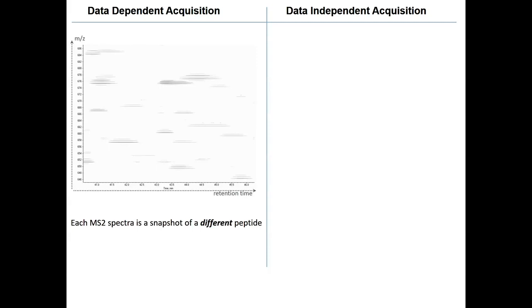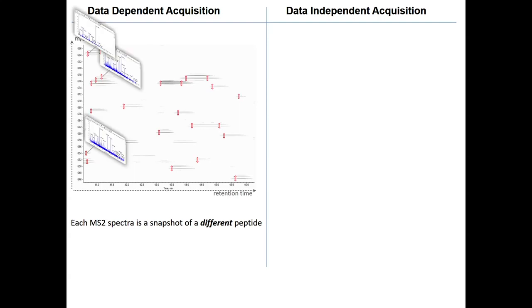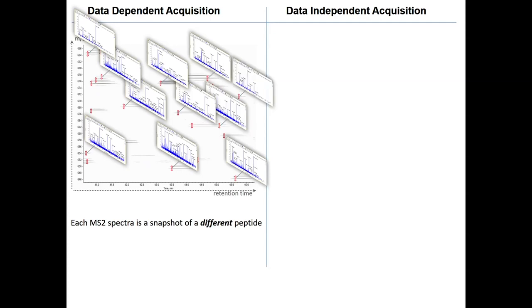This is just to remind you shortly of what, to me at least, is the most important difference, and the reason why I originally thought trapping instruments were maybe not the best instruments to work on DIA. This is MS1 space, retention time versus m/z, a very short zoomed-in version of this MS1 space. You see in red the isolation window that's used in DDA mode. And typically from each of these isolation windows, you get a relatively nice and independent MS/MS spectrum. And in shotgun DDA, you expect that each of these MS/MS spectra is a snapshot of a different peptide.